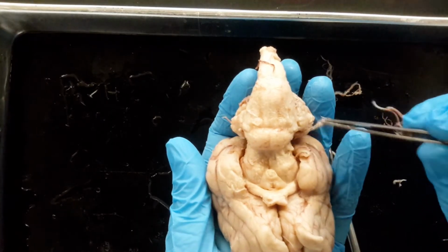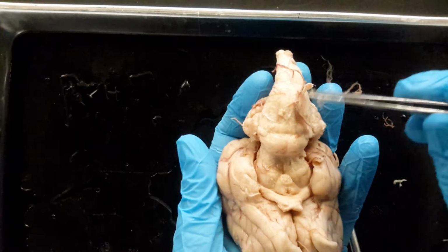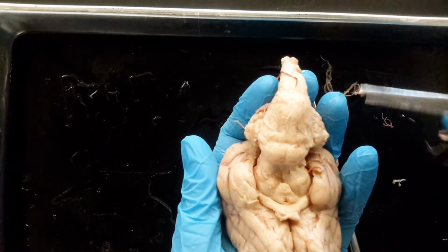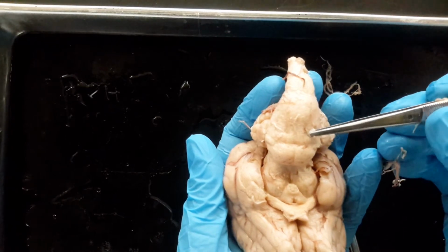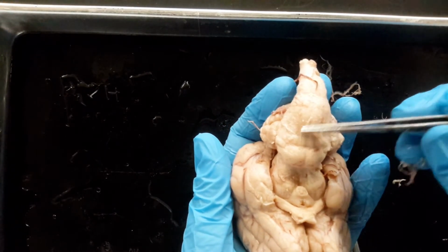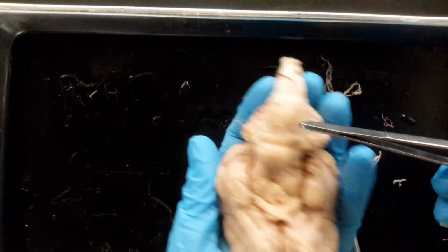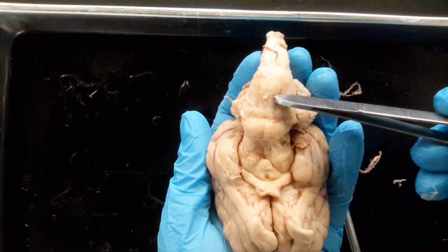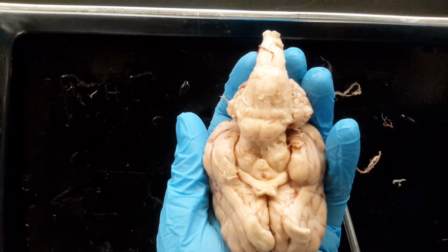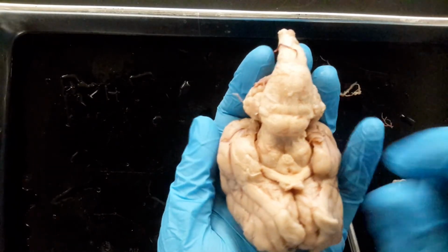You can look in your book. It's okay. The pons. And then I'm clearing off a little bit more here. This is the bottom portion of the brainstem. Anybody know what the bottom portion is called? Yeah, the medulla oblongata. So here, you have the medulla oblongata, the pons, and these are your peduncles. You'll clean up around it so you can see the definition really well.